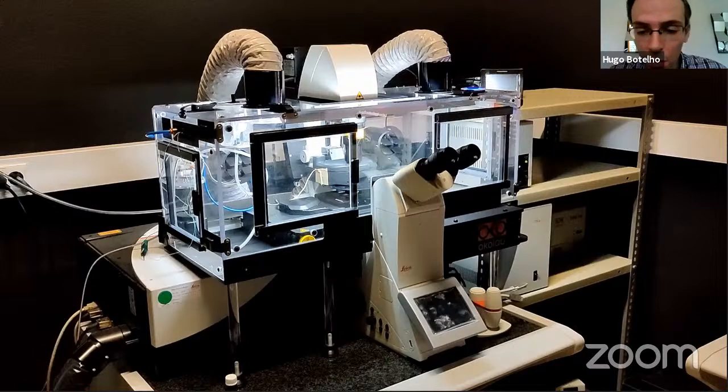This is an example of one of the microscopes we have at our facility. You can see that this is an inverted microscope. It is also confocal, by the way, as you can see by the confocal scan head at the side. The big difference is that all components, including objective, stage, and image position, are remotely controlled by the computer in a way that allows it to image a multi-well plate in its entirety in fully automated mode.